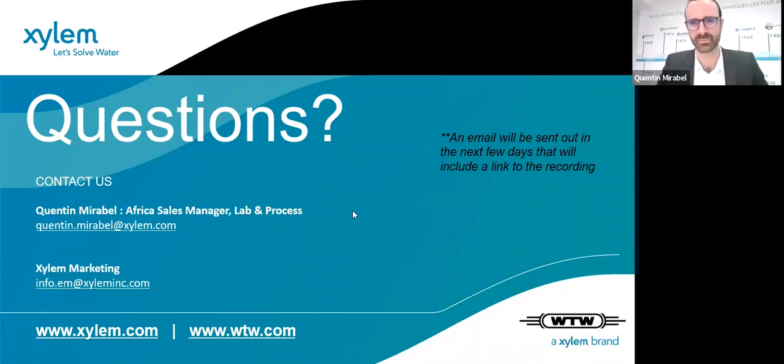Just adding a comment, Georg, about collecting the data. We have several modules like this one that you can stack mount to a transmitter in order to have specific outputs. For example, if you would like to connect it to your SCADA or PLC system, we have specific modules offering Modbus, Profibus, and 4-20 milliamp output.